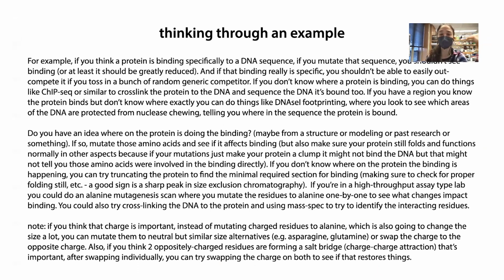Sometimes if your protein just totally misfolds, it won't even express. The cells will be like, nah, won't make it. Or it'll get expressed but quickly degraded, or it'll aggregate together into these clumps, into these inclusion bodies. So those are basic things. But a lot of times it might express fine, but then when you go to purify it, maybe it's a weird looking peak or whatever. That could be a sign that there's something wrong with the folding.